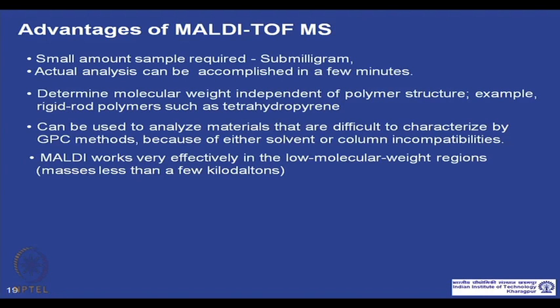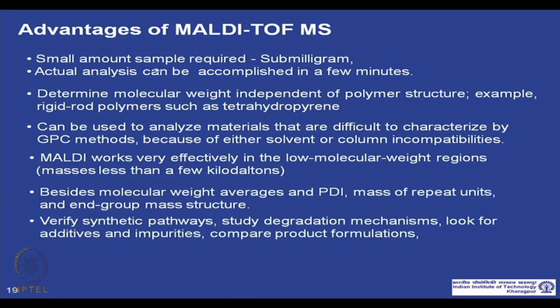Let us quickly go through the advantages of MALDI-TOF. A small amount of sample is required, very sub-milligram, and this analysis happens fast, within a few minutes compared to the other techniques, very efficient.